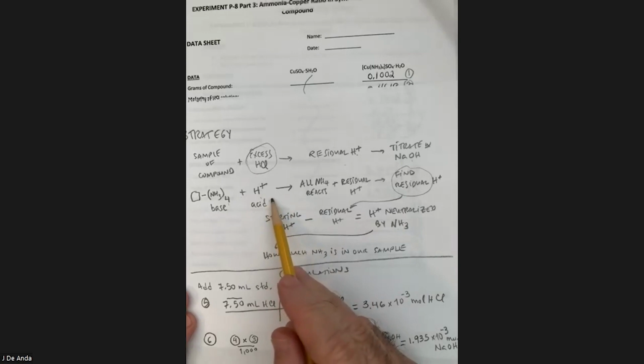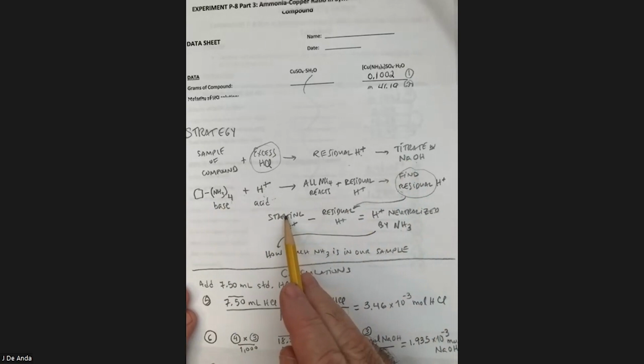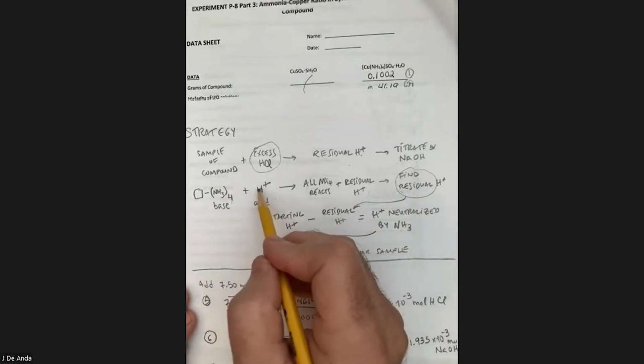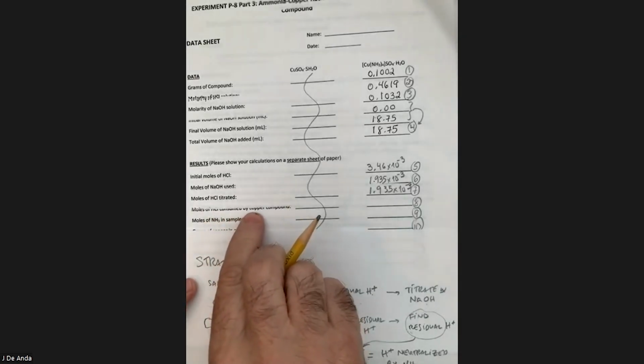Now here comes the fun part. Remember that in our strategy, however much was left over, the residue, after the reaction of acid with our compound, that is what we titrated with the NaOH. So we started with a certain amount. There was this amount left over. So whatever the difference is, that is the amount of acid that was consumed by our compound, by the ammonia in our compound. So let's go ahead and calculate that. This will be item number 8. So this is the moles of HCl consumed by our compound. Sorry that the printing came out a little sketchy there.